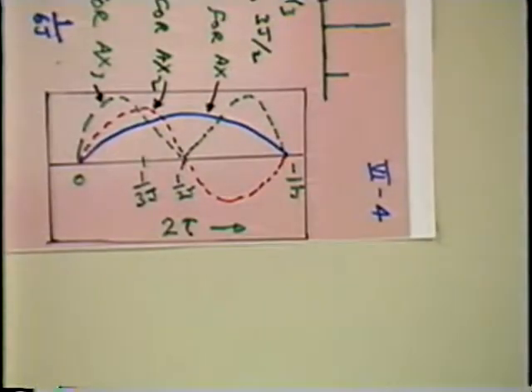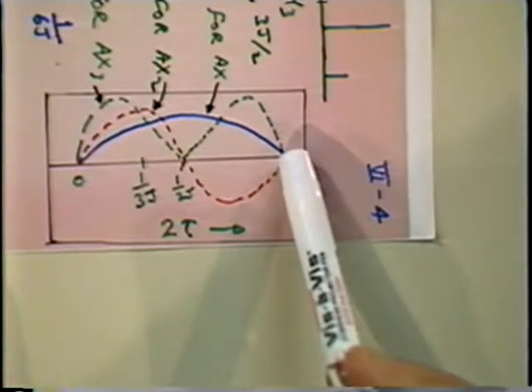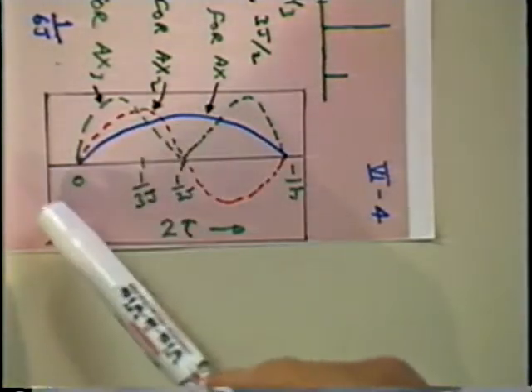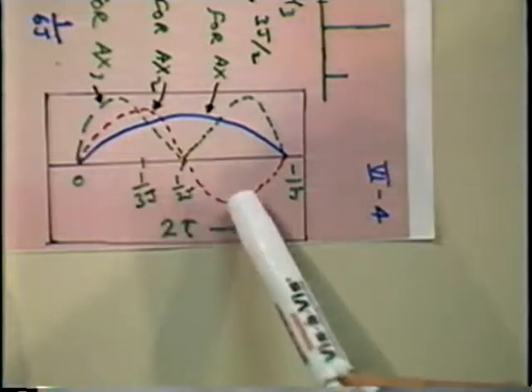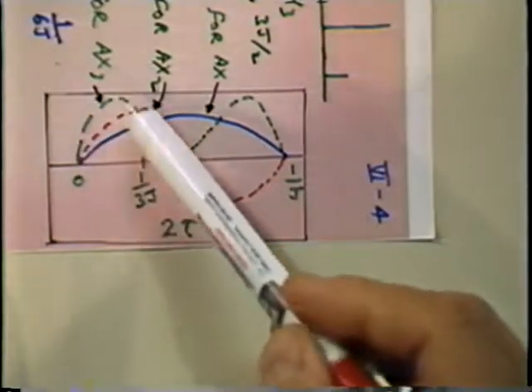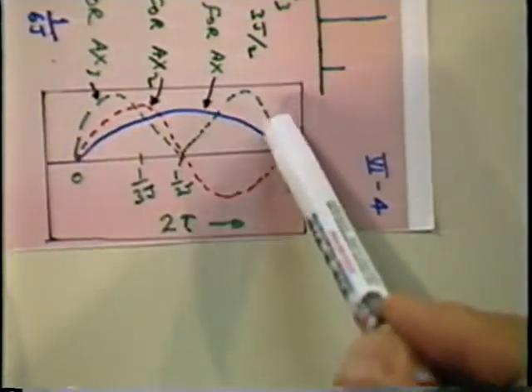You can see I have plotted these functions that I have written down here, and they look like this. The CH group as a function of tau will have this behavior. This thing is plotted here as a sine curve. Then there is a sine cos curve, which is nothing but twice the sine curve. It has twice the frequency. And then we have a sine cos square curve, which has this behavior for the CH3 group.